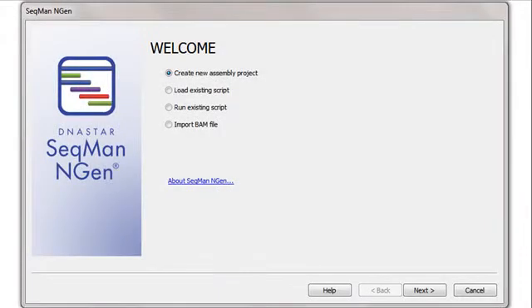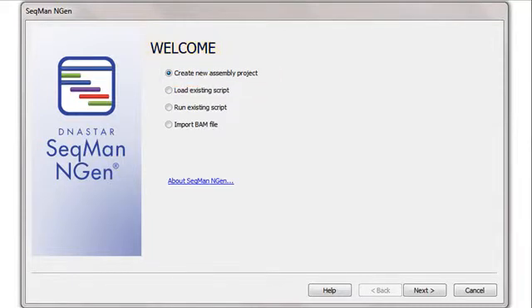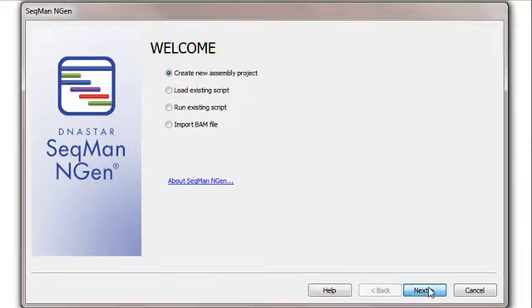To perform a de novo assembly of Transcriptome sequence data, I'll launch SeqMan NGen, and in the Welcome screen, I'll choose Create New Assembly Project. To move to the next wizard screen, I'll just click the Next button.